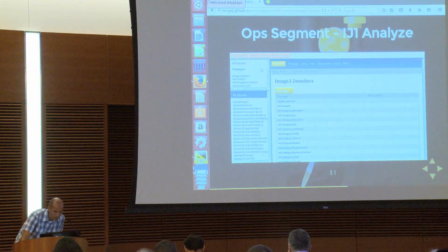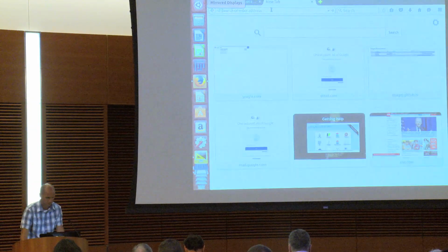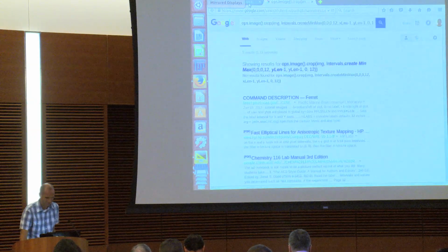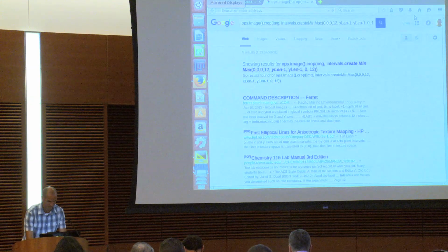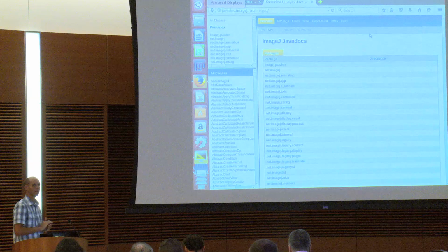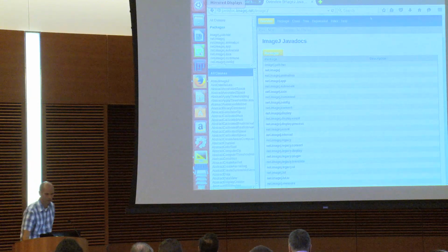And maybe I should get this into here. Oops. Didn't work. So we want to know what threshold methods are available. How do we do that?